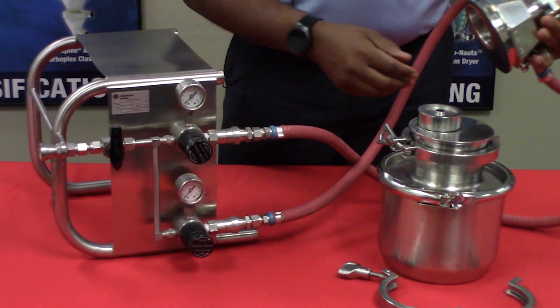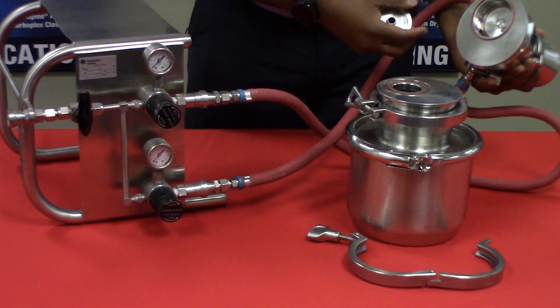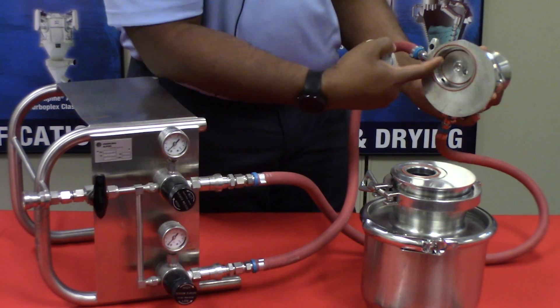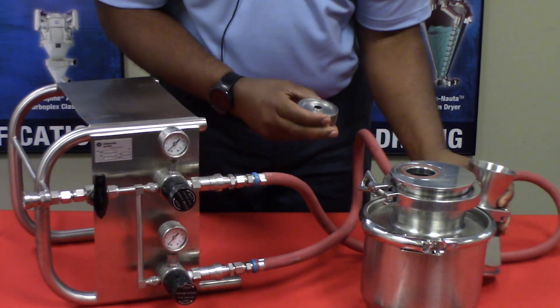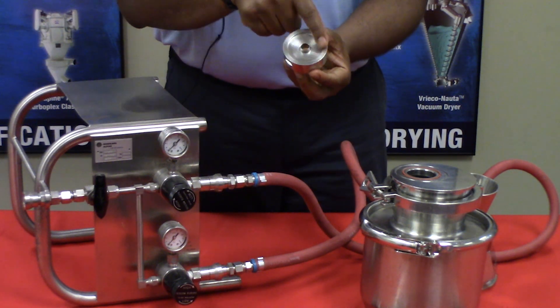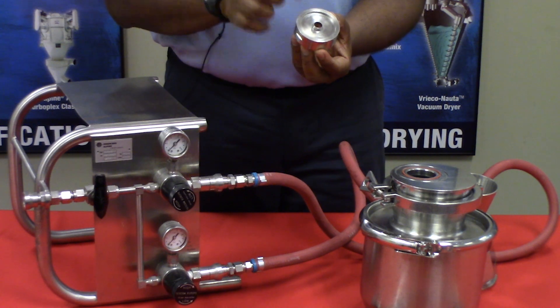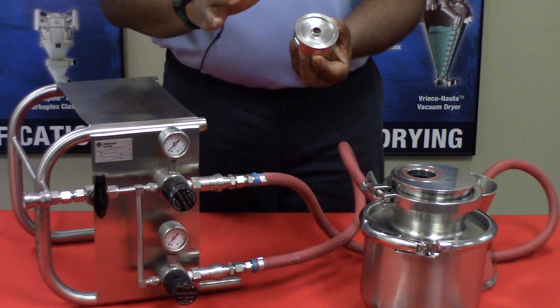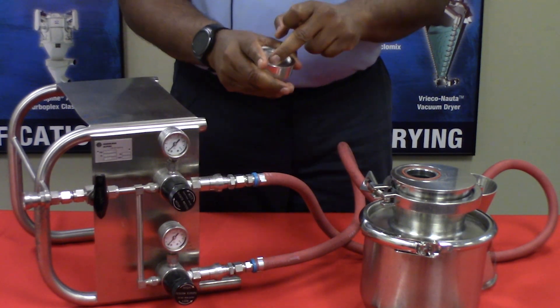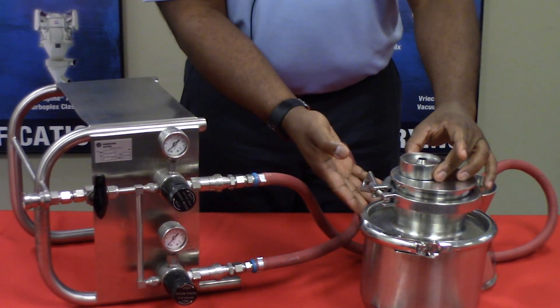You feed the material at this point here. This here is called a grinding ring. As you can see inside the chamber, this nozzle ring has four grinding nozzles. Compressed air only goes through these nozzles — no material. It accelerates the particles, which collide with each other and impact against the side of the chamber. This nozzle ring sits on top of the discharge hopper.